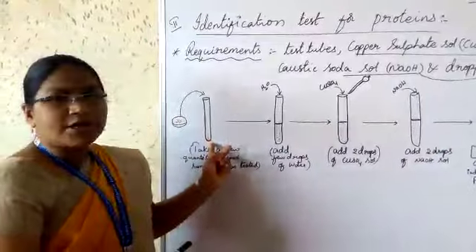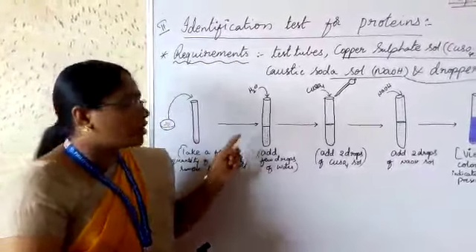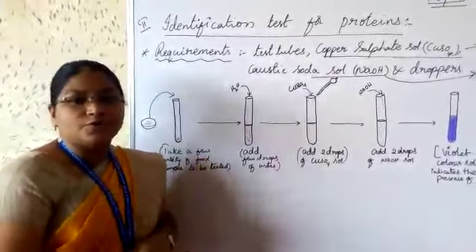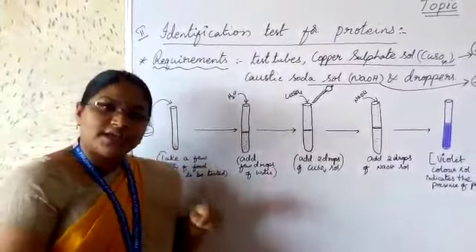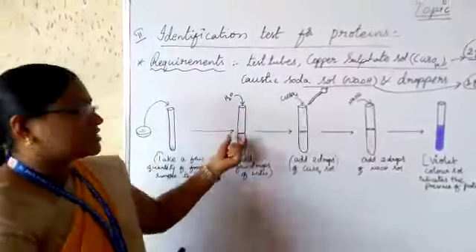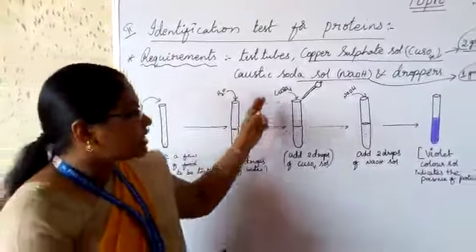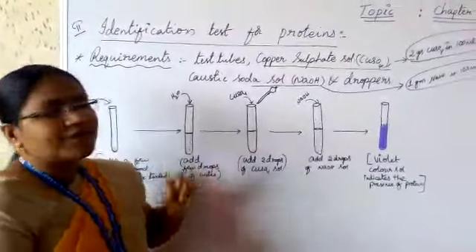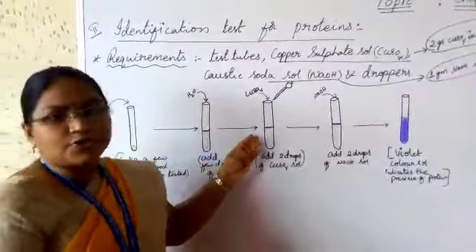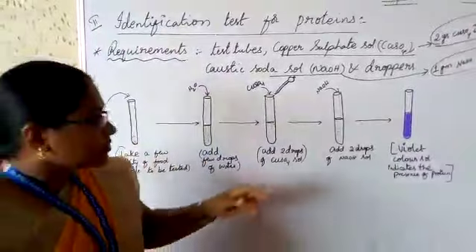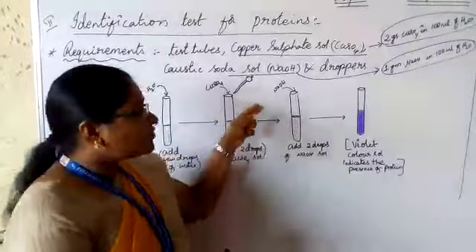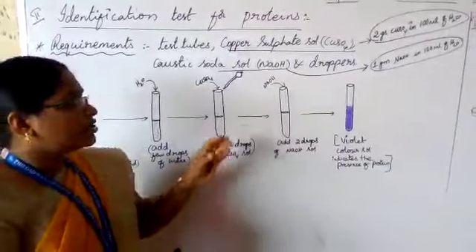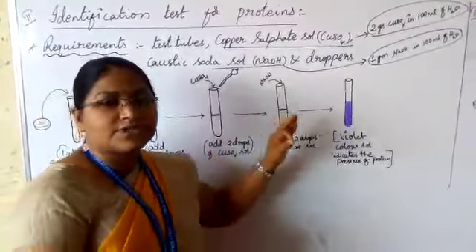Then add 10 drops of water to the solid sample to dissolve it and make a sample solution. If it doesn't dissolve, shake for some time. Then our sample solution is ready to test. Afterwards, add 2 drops of copper sulphate solution to the sample solution by using dropper. Shake well. Then add 2 drops of sodium hydroxide solution to the sample solution by using dropper. Shake well and keep it aside for a few seconds.